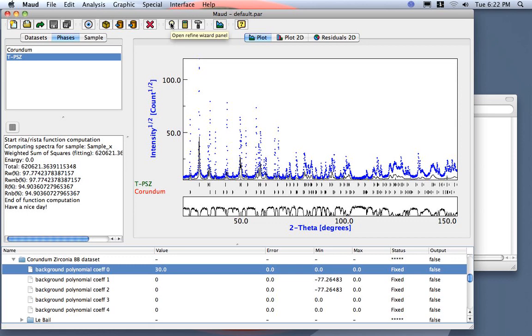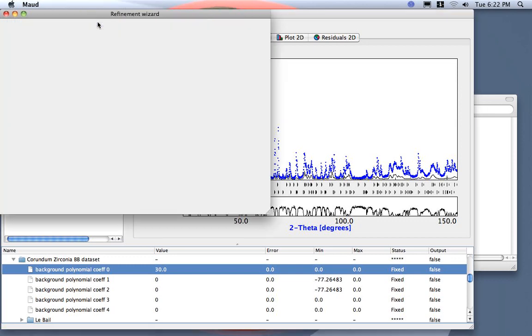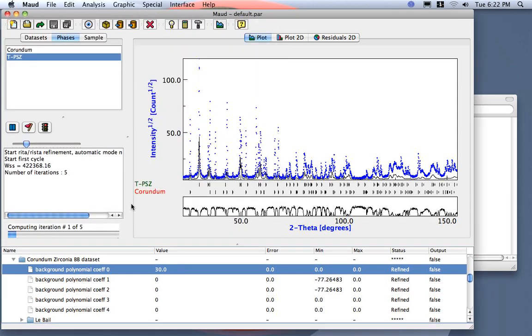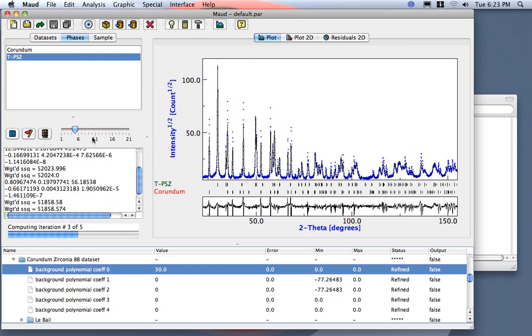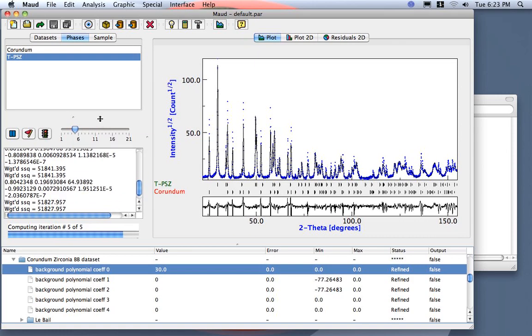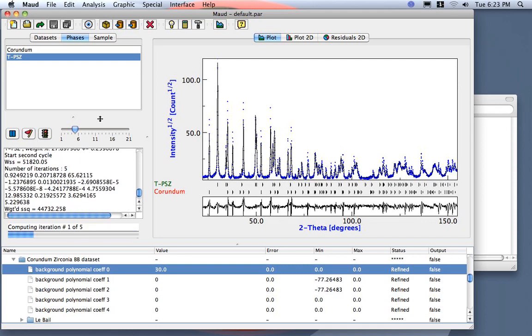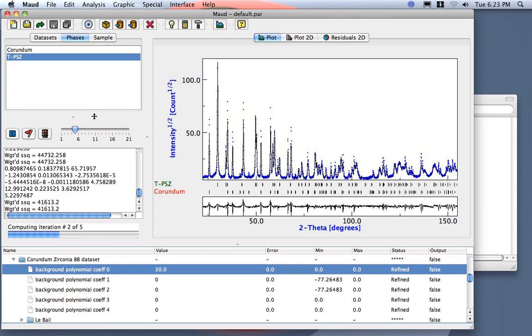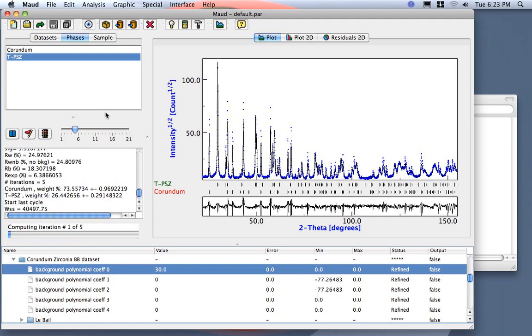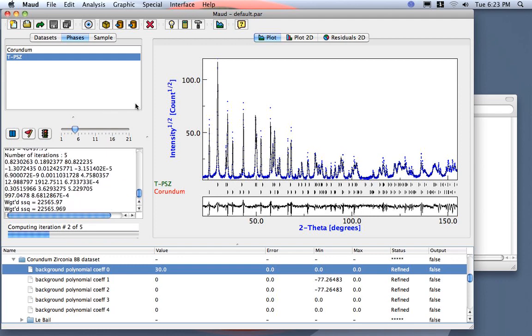So I select the wizard here, or you just go analysis wizard here. We select the quantitative analysis and we go. I adjust this. So I can see this. This is five iterations each step and you will do three steps: one to adjust background intensity, now it's in the second step to adjust peak position, and in the third step the program also adjusts peak profiles by refining crystallite size and microstrain.